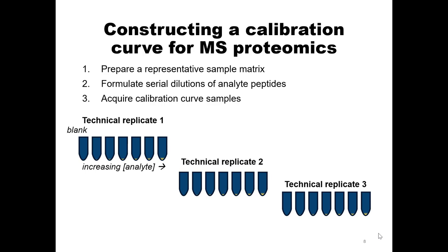So sometimes doing that initial very thorough check of here's my high, here's my low, and then interspersing the number of points in the middle, means the curve that you would run from there would be very well distributed to your sensitivity range. It's generally a good way to go about it. Sometimes you get really lucky and it's that inflection point.